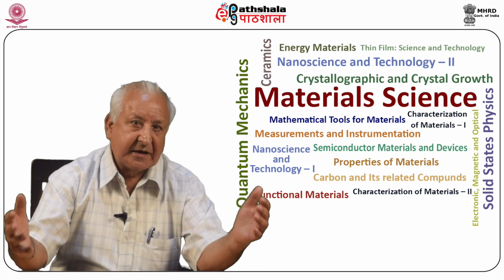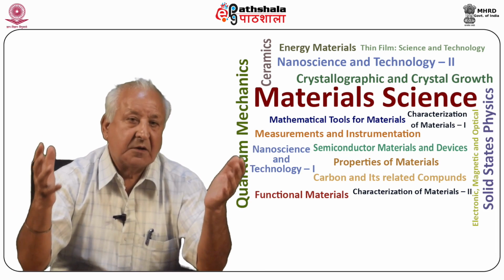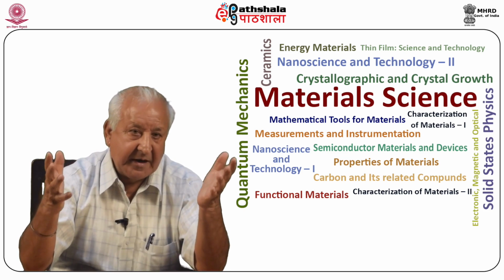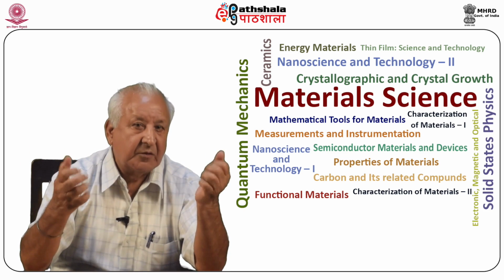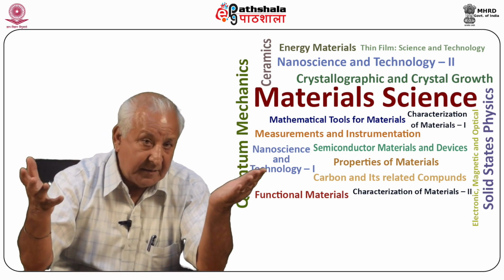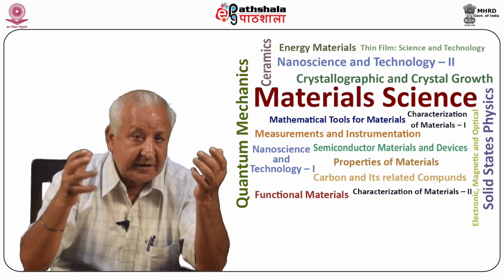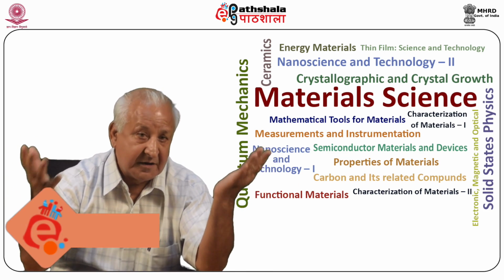So students, let us summarize what we have learned in this module. We have learned about crystal growth by the gel encapsulation method. The structure and properties of gel have been explained. The mechanism involved in the gelling process that makes it effective in the crystal growth process is discussed. Various techniques of growth by gel method, including growth by chemical reaction, chemical reduction method, complex decomposition method, and solubility reduction method, as may be applicable for the growth of some specific crystals, are described.